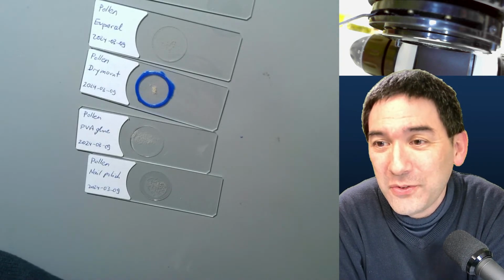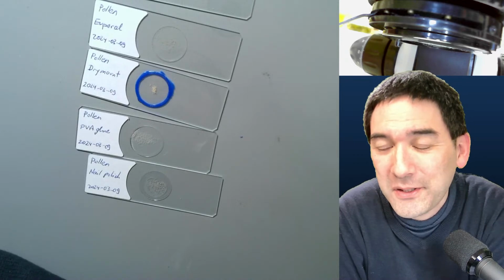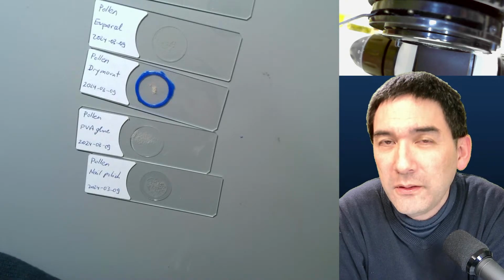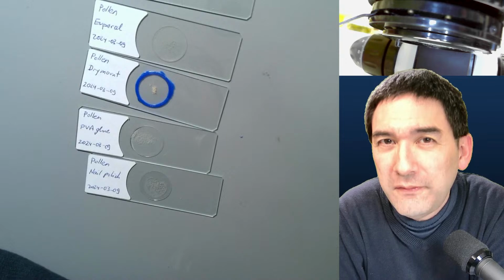Yeah, I've been using PVA glue to mount samples, but when it dries, the glue makes the samples look almost like frosted glass. Is there something I could add to the glue to make it clear? You have to use clear PVA glue.